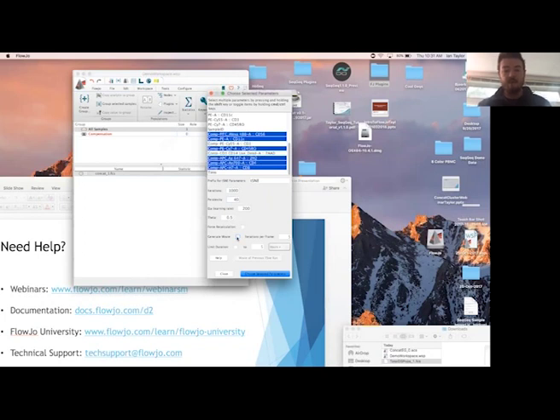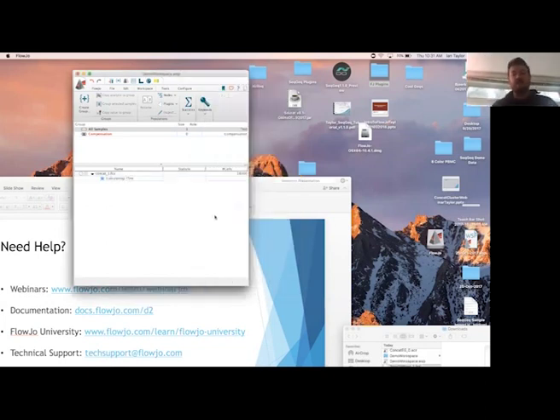I don't need to generate a movie. That's just going to create a whole set of SVG files that we could utilize to create like a live movie of the clustering occurring, or the mapping occurring, excuse me. And that all looks good. So without further ado, let's start the calculation process. Now this is expected to take at least a little while. So we would welcome any questions that you might have at this point.